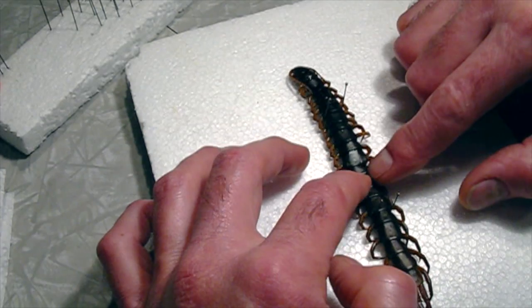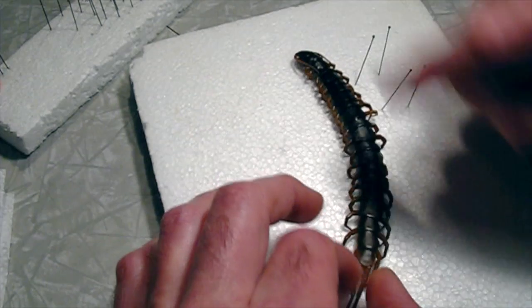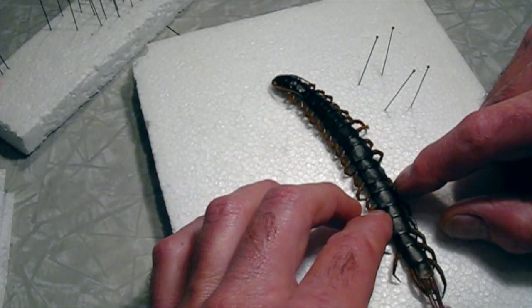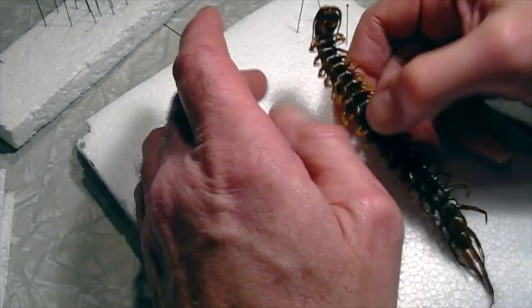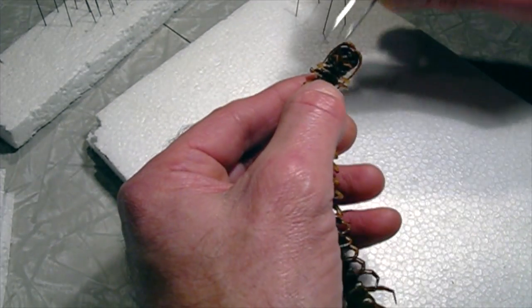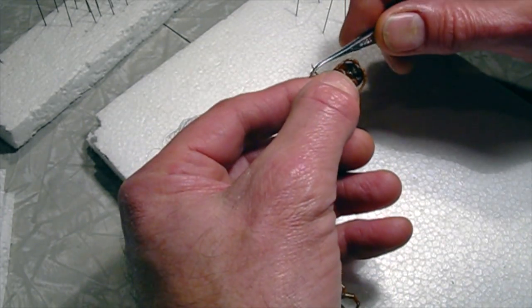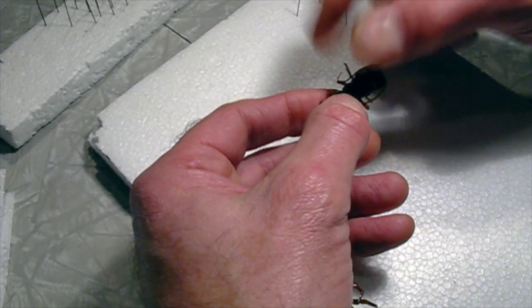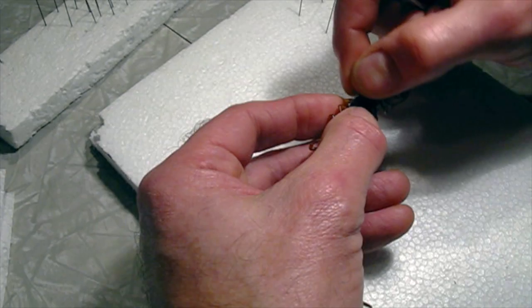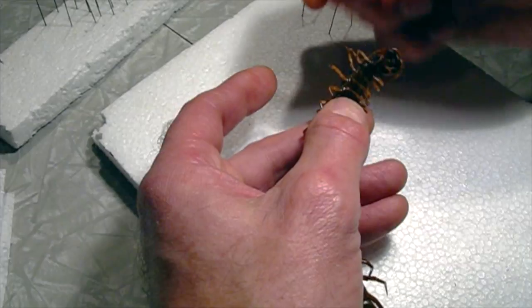You can see that this thing has gotten stiff and that it's in this naturally curled position, bent. So by putting pins along the length of the body, I'll probably get it as straight as it can be. Before I start trying to position it, I'm going to manipulate the legs. These legs are fairly stiff, and I'm going to take each leg and pull it out to try and get it loosened up a little bit. I'm just going to do this one at a time.